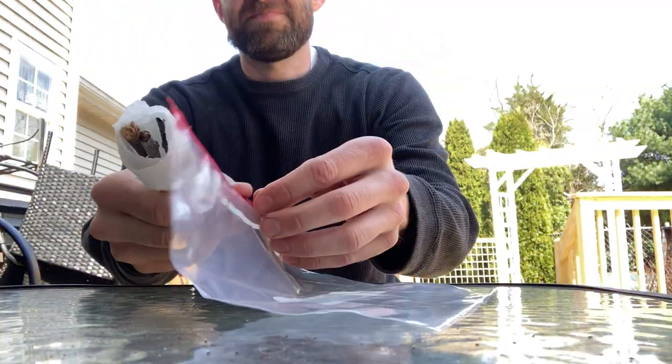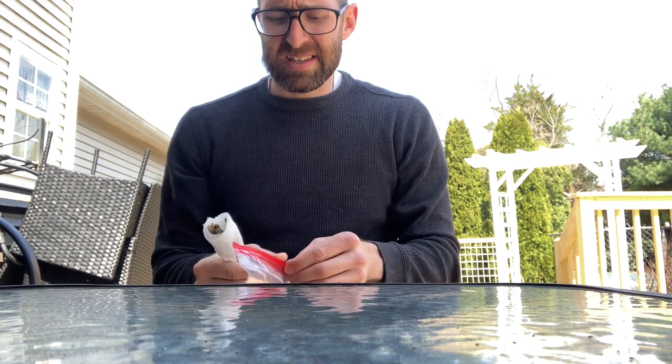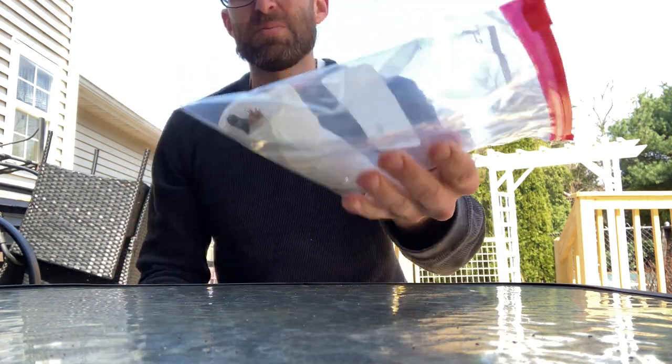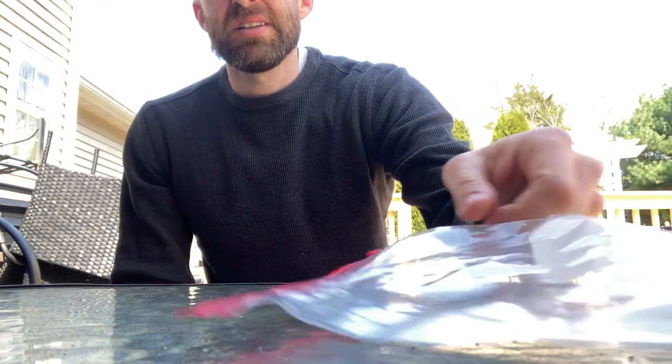You would then seal them and place them in a sealed plastic bag like so. You would put this in a warm place, and in a couple of weeks you should see the development of roots at the ends of your cuttings. It should look something like this. Once you get to that stage you're ready to move on to actually planting these into your propagation system.